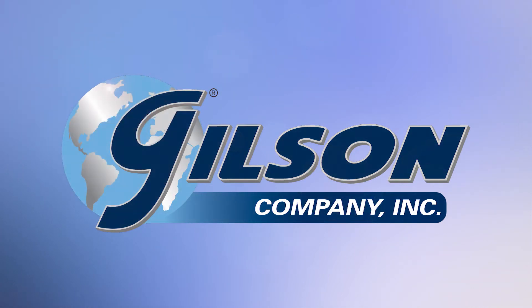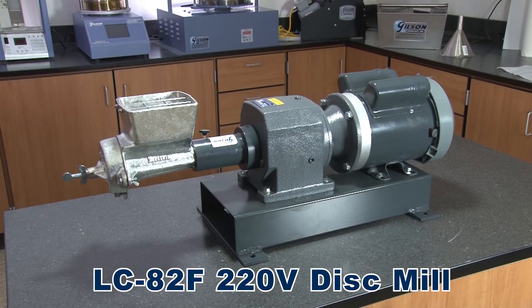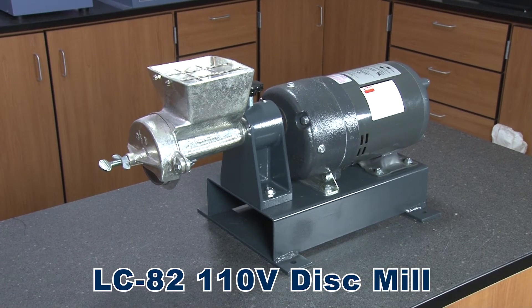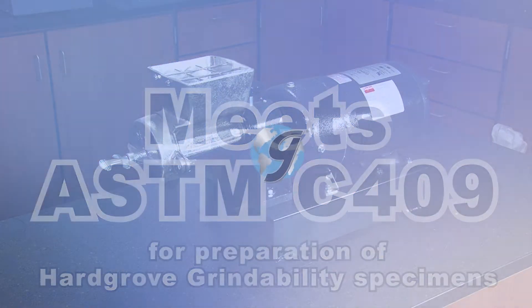The Gilson LC82 motorized disc mill provides effective performance in limited dry or wet grinding samples for test preparation. This reliable motorized disc mill meets ASTM C409 requirements for preparation of test specimens.